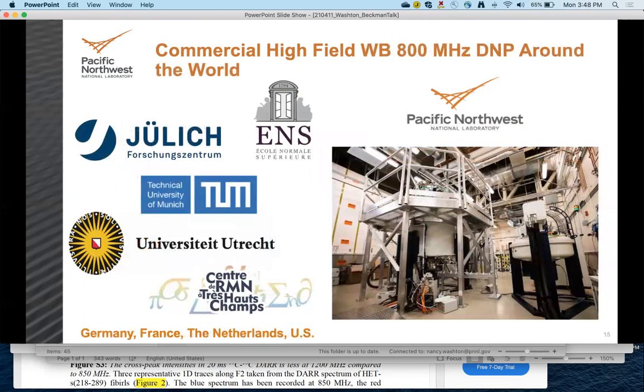So for high field wide bore 800 megahertz DNPs, until this year, all of them were in Europe. The first one in North America, and again, I note this is a commercial instrument, the first one in North America at 800 megahertz is at Pacific Northwest National Lab, and you will see a photo of that system installed in my lab.